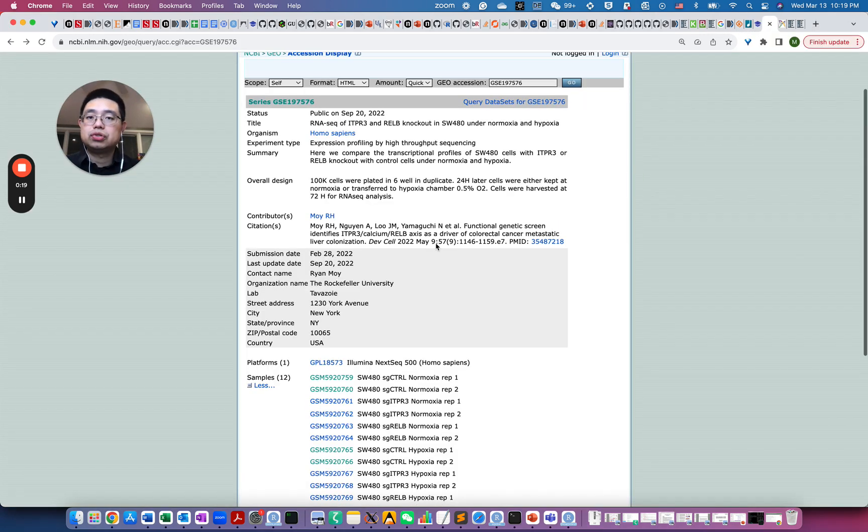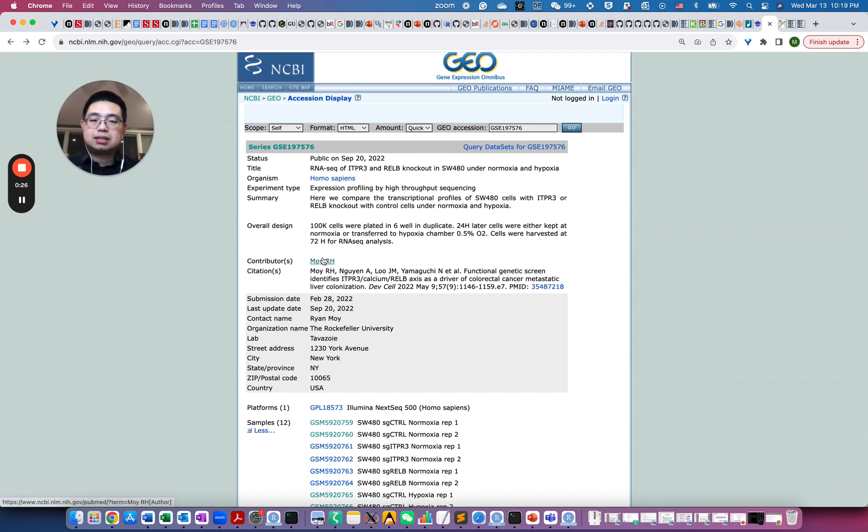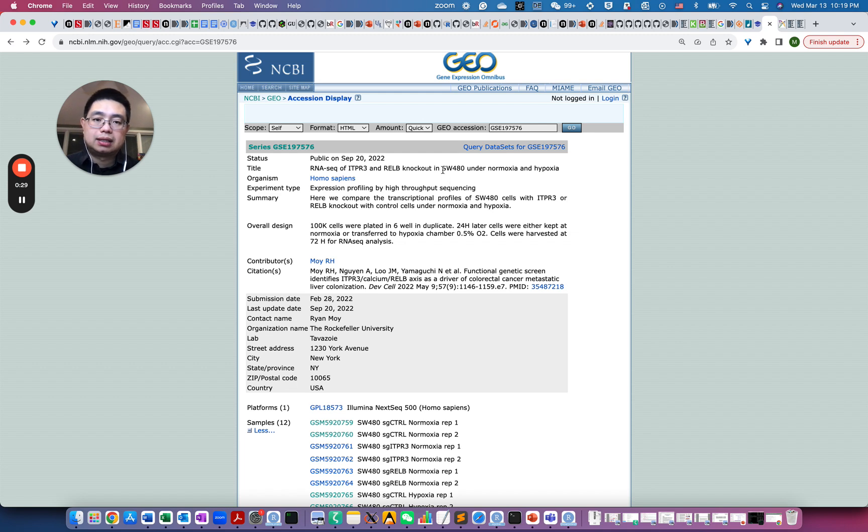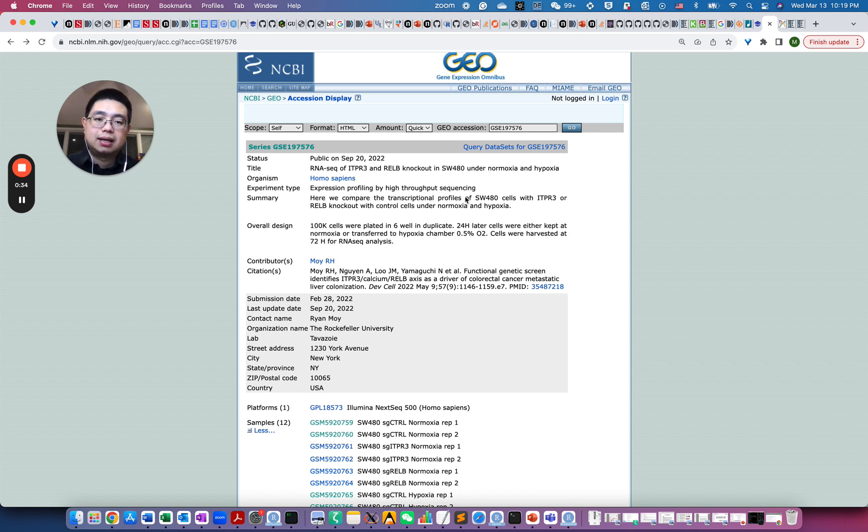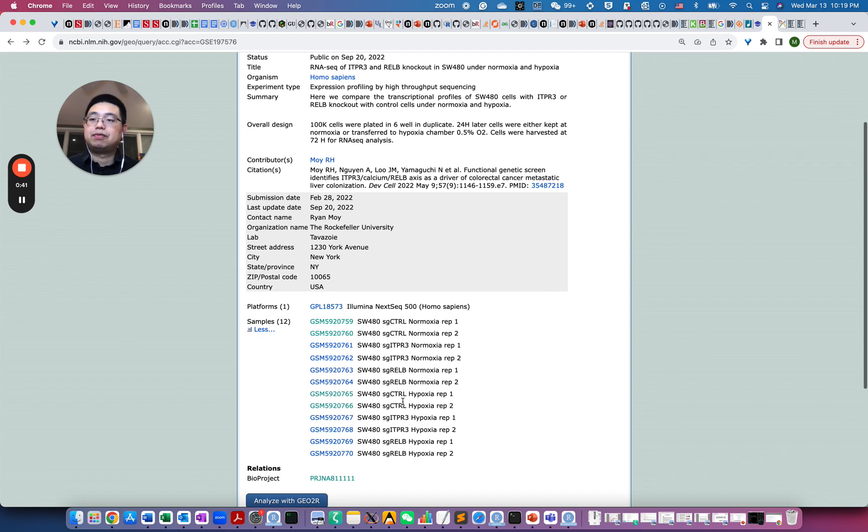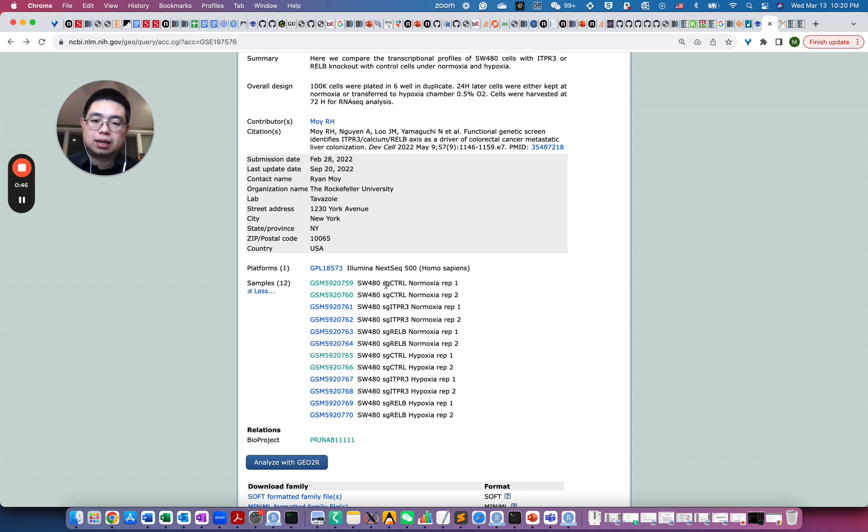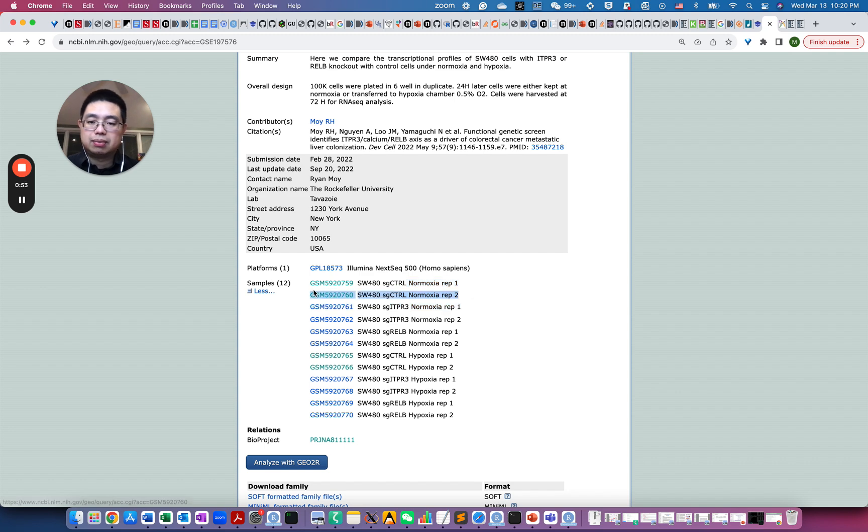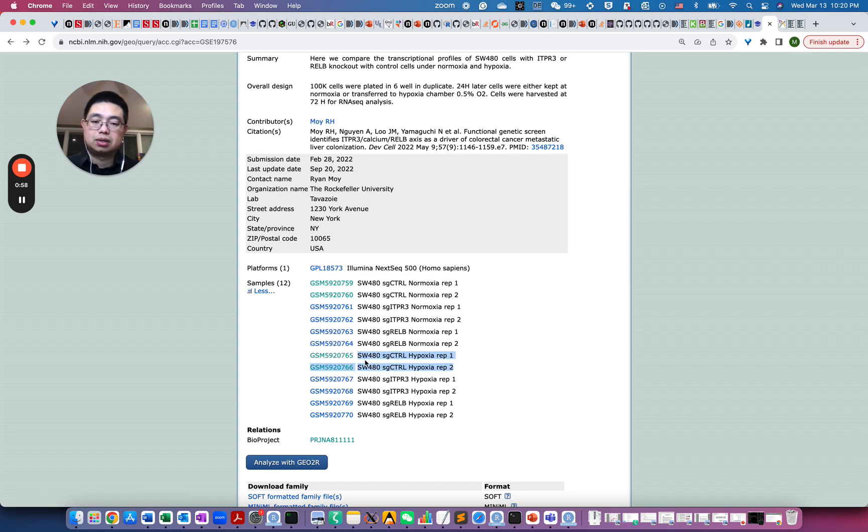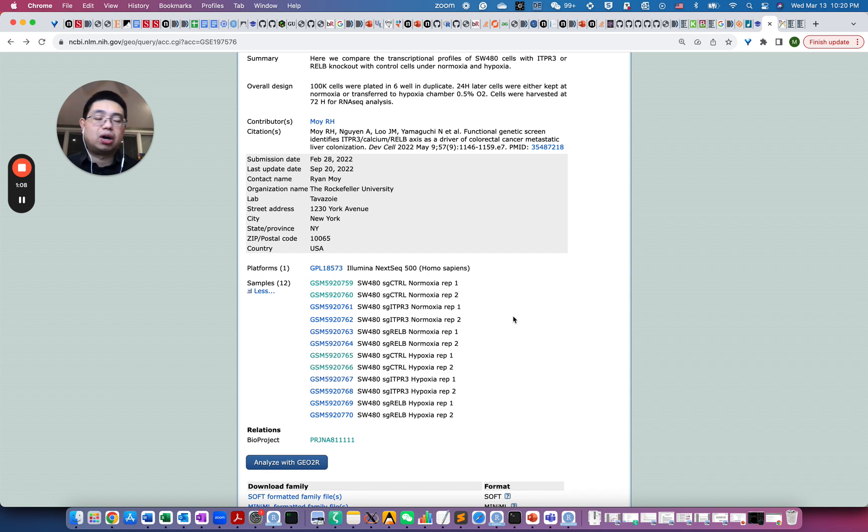So if you go to GEO and go to this accession number GSE197576, this is an experiment for this cell line called SW480. It's a colon cancer cell line under normoxia and hypoxic condition. And it also has a knockout for a couple of genes. But for the purpose of this video, we're going to just use the control sgRNA, so essentially there's no knockout here on the normoxia condition, and the two samples here and also two samples that are on the hypoxic condition. So those are the samples we're going to use. So essentially, we just want to find the genes that are differentially expressed on the hypoxic condition versus normoxia condition.